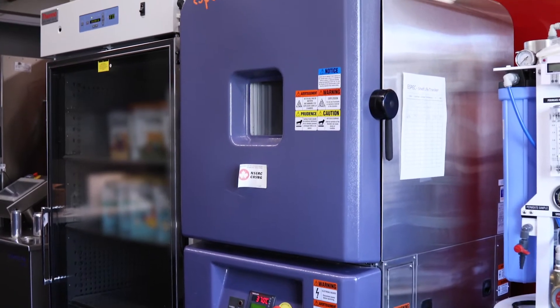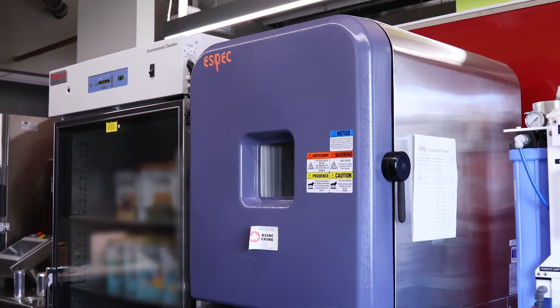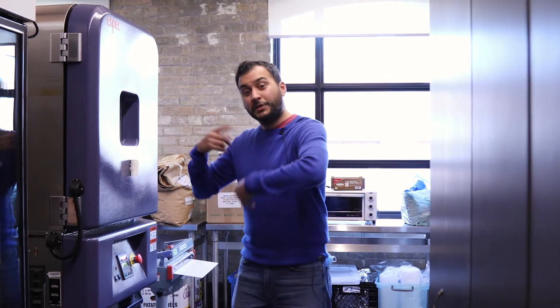Here we have a shelf life accelerator. So if you want to test a product — how long the product is going to be safe on a shelf — you don't want to leave it on your counter for two weeks, as that's going to take you a long time to get your results. So you put it in this machine and it will quickly accelerate that process, so in a couple of days you'll get what you would normally get in a couple of weeks.